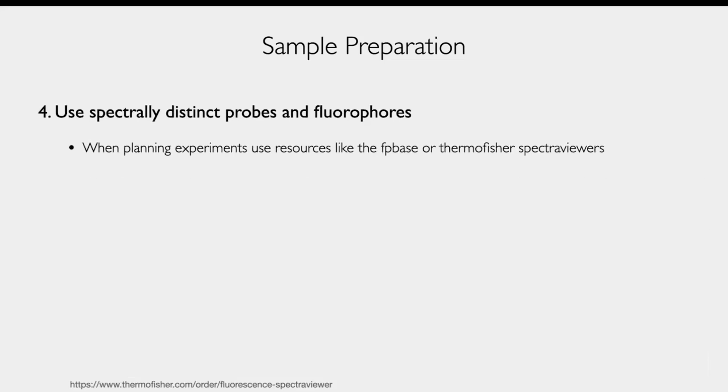Another simple thing is to use probes that are spectrally separate. This is something that you can easily check for yourself.